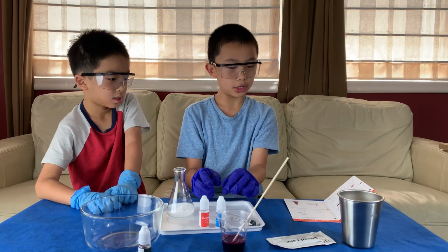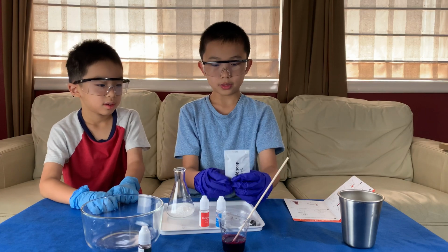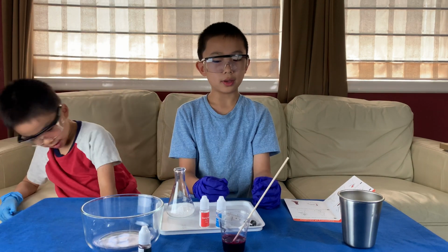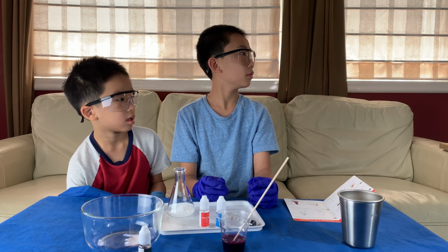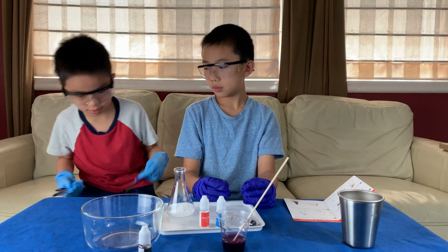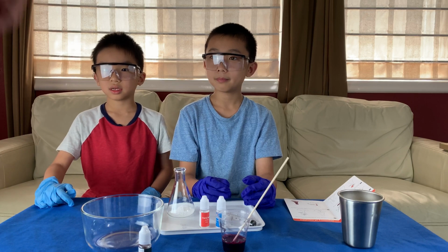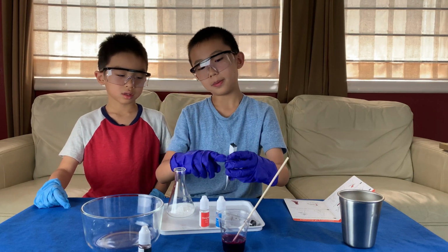Okay, next we add the liquid soap, which will later cause the mixture to foam. Liquid soap, okay. We need scissors, I think. Watch out for the foam. All right, I'll get scissors. There might be citric acid or sodium carbonate residue, so wash your hands after. Don't knock anything over. Just leave the scissors out. Go wash your hands and I'll wait for you. No, that's fine. There might have been residue, but that's fine.